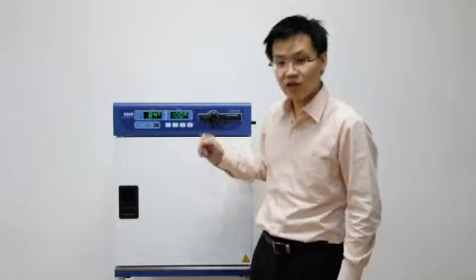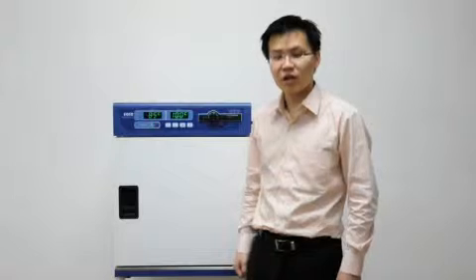The temperature range for these ovens is from ambient plus 5 degrees Celsius to 300 degrees Celsius. Typical applications include batch testing, curing, drying, stabilization, and other processes.